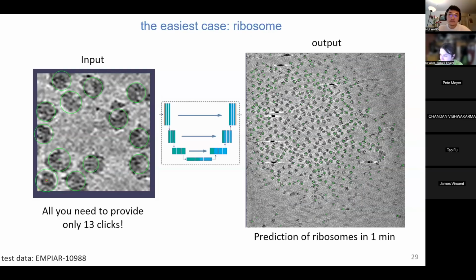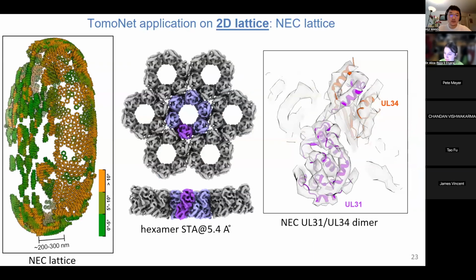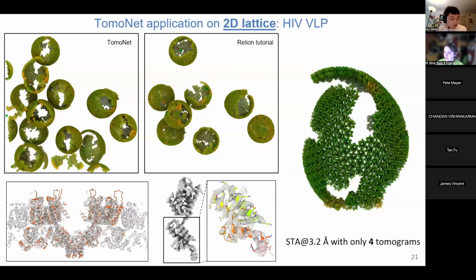I noticed some missing particles in your lattices. Do you think that these are actually missing, or simply that the particles weren't picked, or they were removed during the reconstruction process? Is there a good threshold to eliminate particles, for instance, if their angle relative to their neighbor is unreasonable? And is there a good way to quantify this so we can justify calling them empty, broken, or something else?